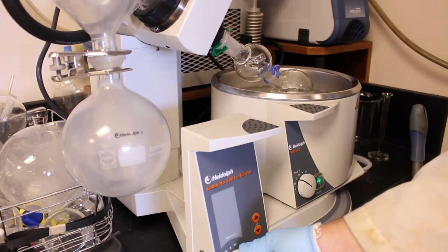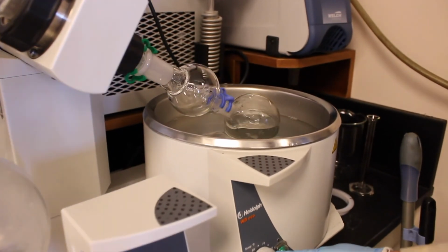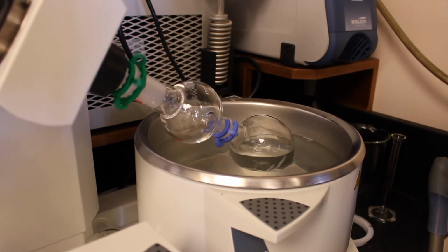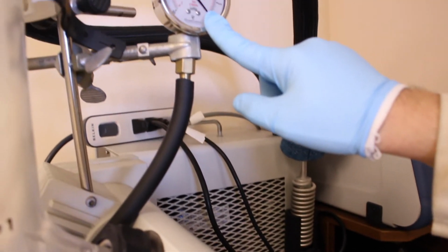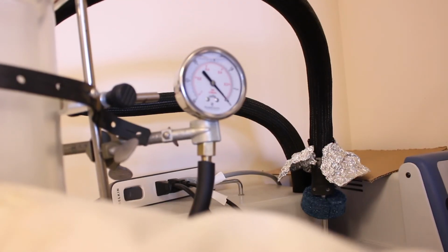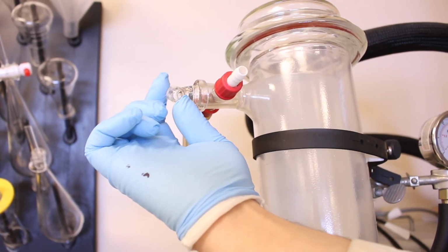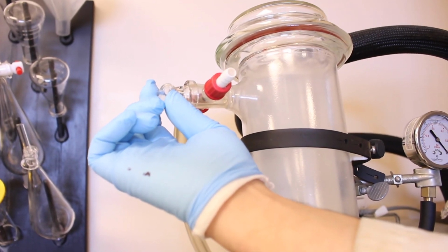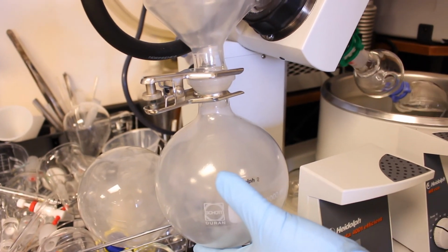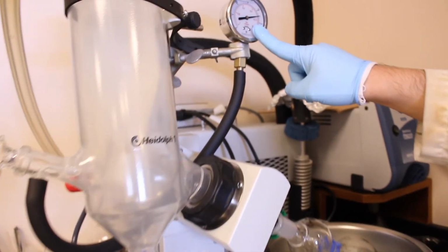So we'll begin our rotation here. So you can see the flask is turning. And we're going to turn on the vacuum. Now, right now the vacuum gauge is at 0, and that is because the vacuum is not connected to the glass apparatus. So to do that, we're going to rotate this piece of glass this way. And we're going to, let's see, oh, maybe it's not forming a good seal. Here we go. All right, and as you can see, the vacuum is slowly increasing.